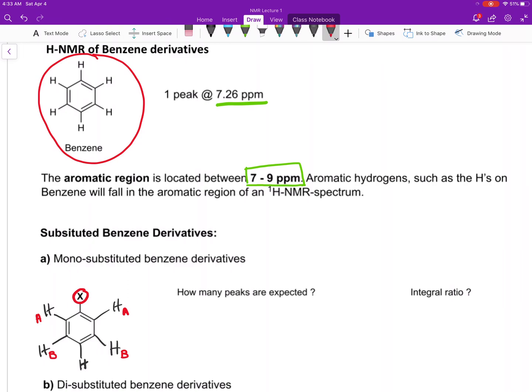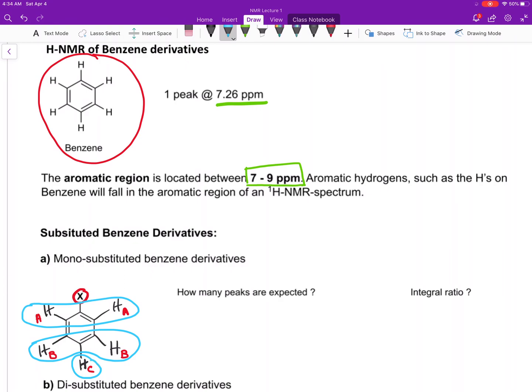Finally, there is a hydrogen at the para position, all the way across from X. This hydrogen is unique from the others — it is farthest away from the substituent. Therefore, the two HAs are going to have a peak of their own, the two HBs are going to have a peak of their own, and HC is going to have a peak on its own. So we expect to see three peaks. The integral ratio would be two to two to one.